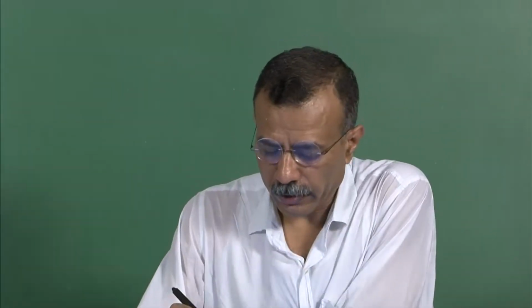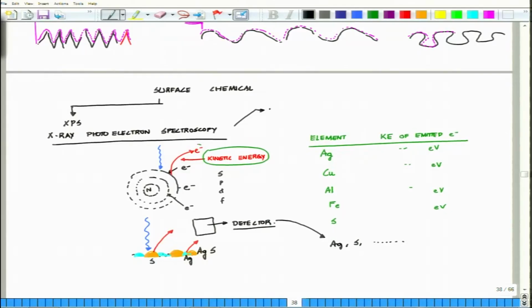The power of the technique is that you can do a very simple elemental analysis, a surface analysis, and you can talk about some form of advanced imaging or atomic imaging of materials.